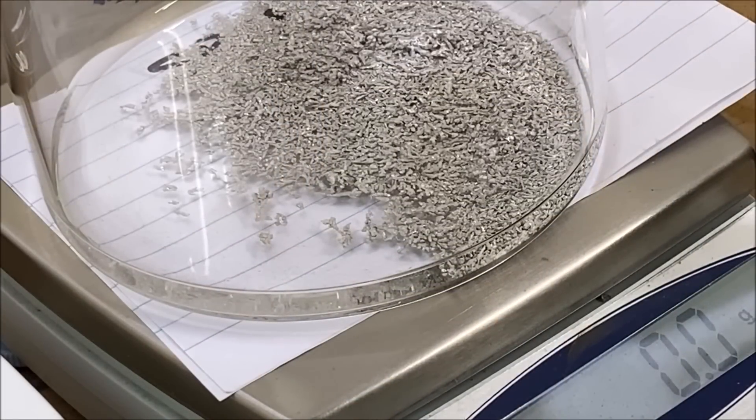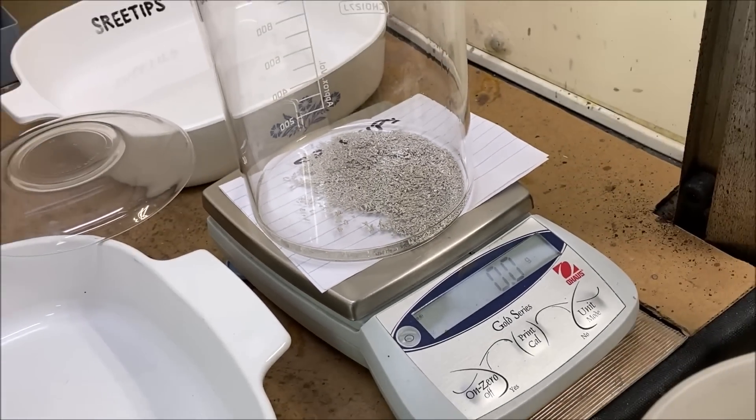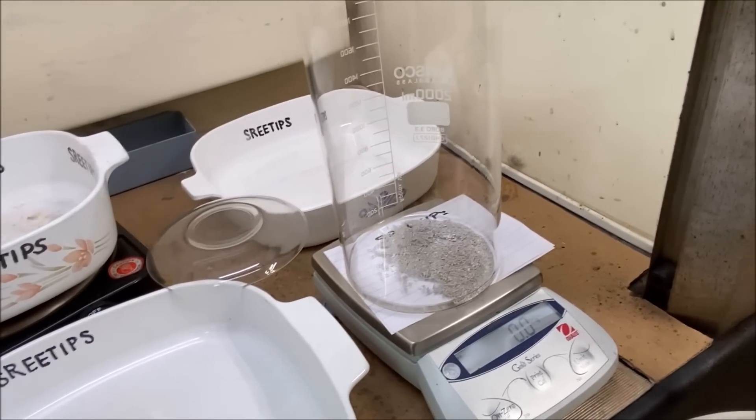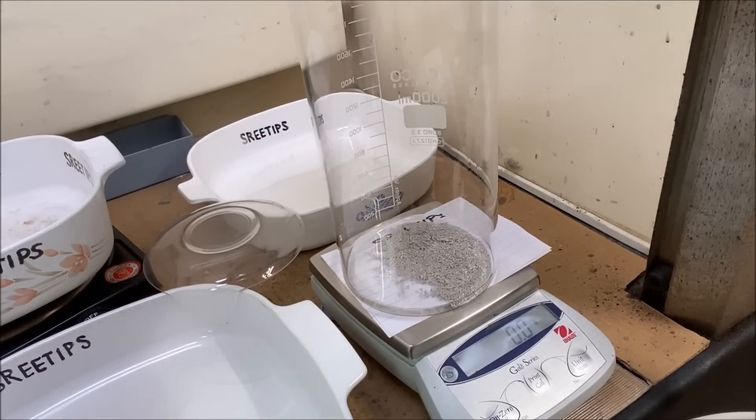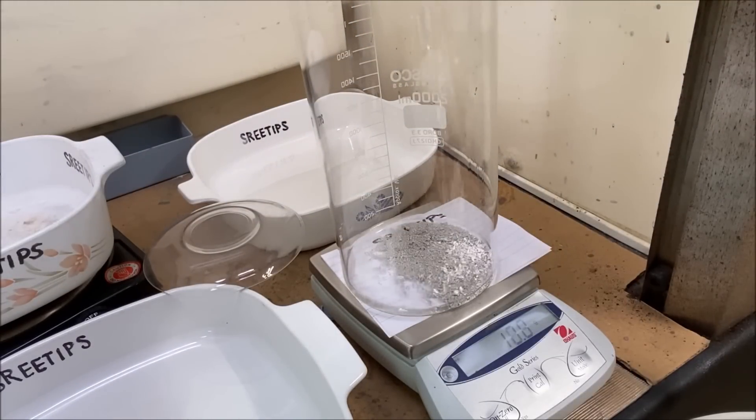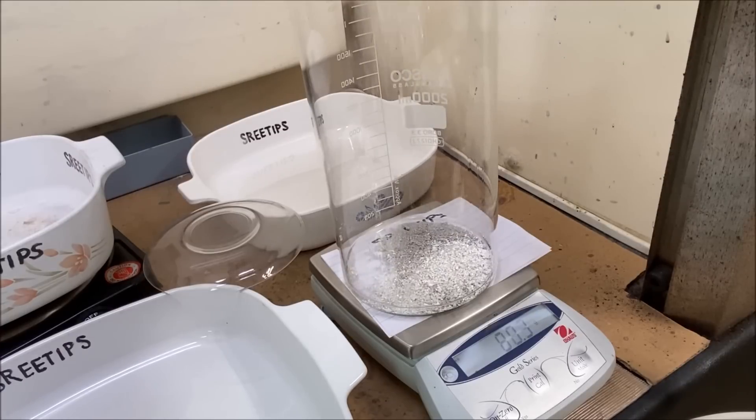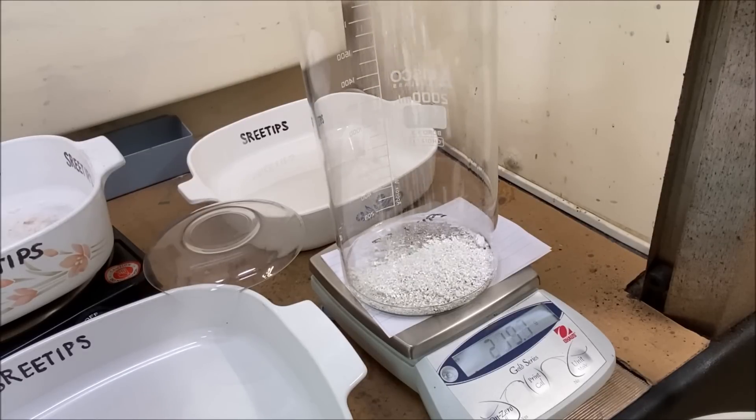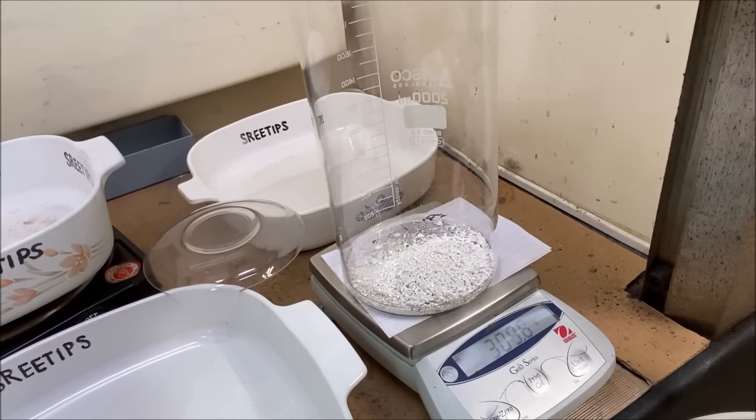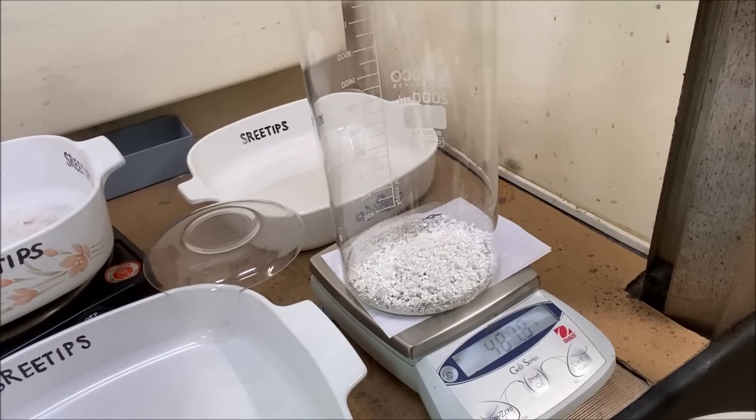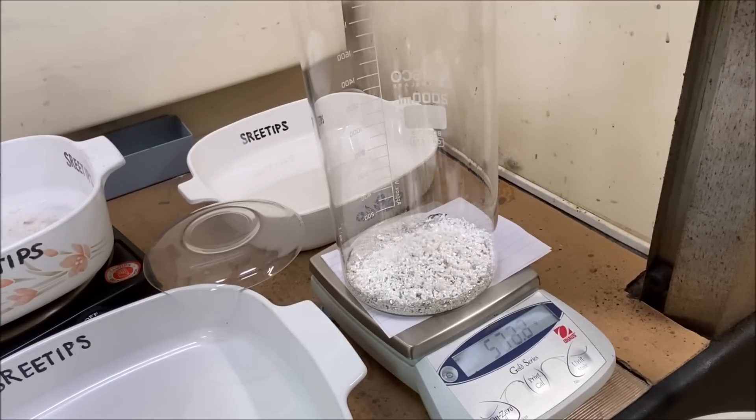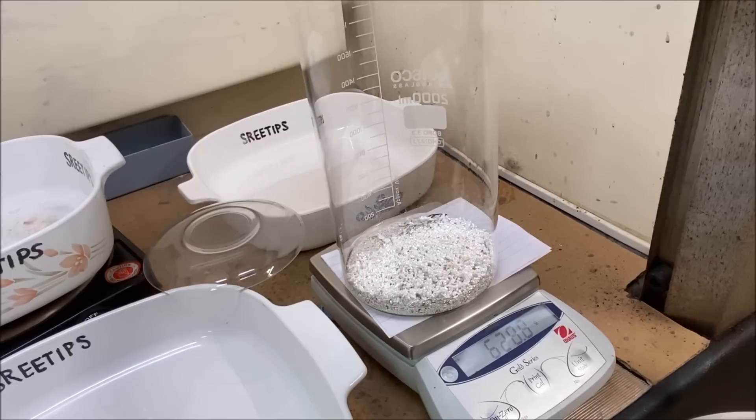We've got the beaker tared to zero on the scale, so now what we'll do is I've got some silver crystal here and I'll measure out about 600 grams of this into our beaker. That's enough, that's about 627 grams of pure silver added to the beaker.